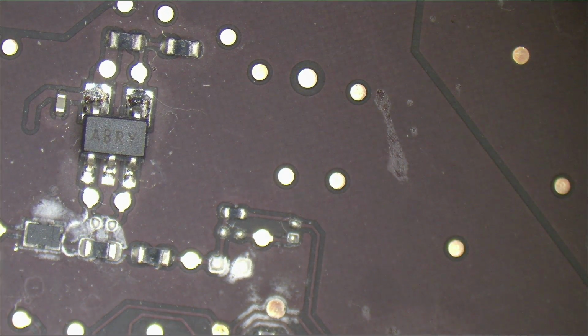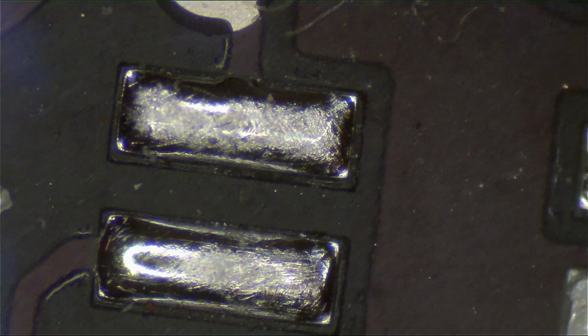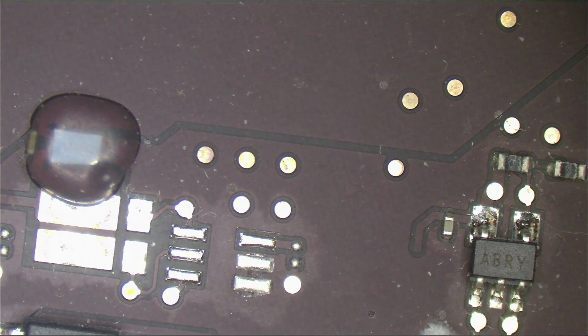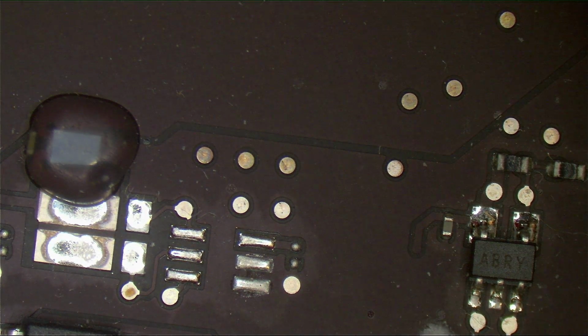The next thing that I like having is an adjustable light. So the microscope that I link to has an adjustable light. One thing you're going to notice when you zoom in a lot, you have less light available than when you zoom out. So when I zoom out, it's like turning the lights on when you're just about to wake up. It's terrible. So I like having the adjustable light because I can then turn it down.